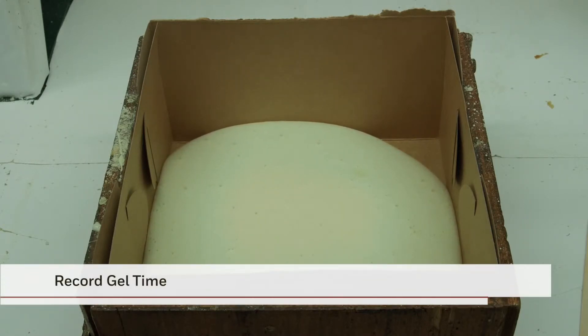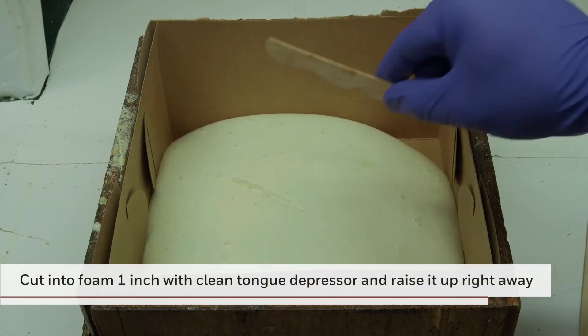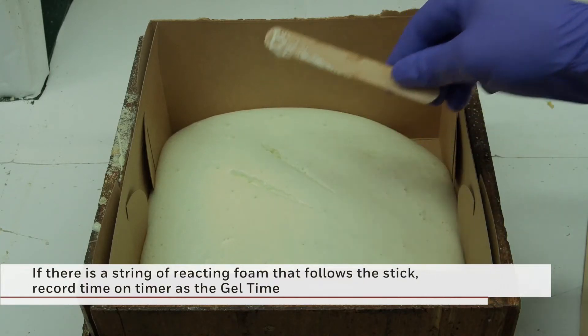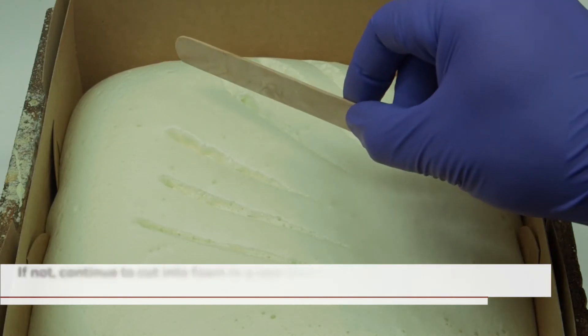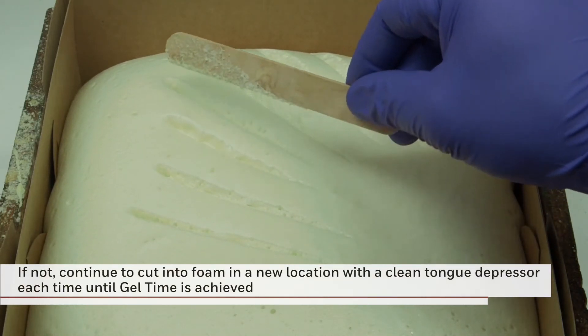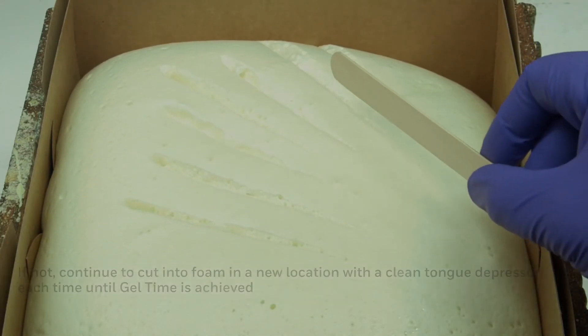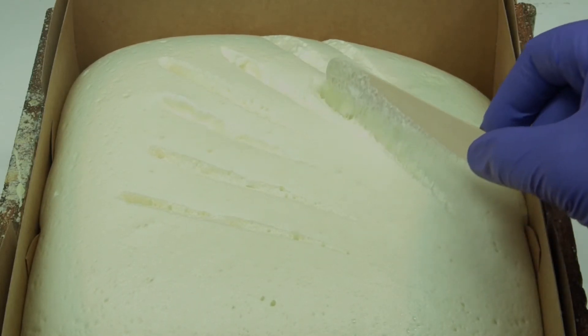Next, you can determine the gel time. Cut into the foam 1 inch with a clean tongue depressor and raise it right away. If there is a string of reacting foam that follows the stick, record the time on the timer as the gel time. If not, cut into the foam in a new location using a new, clean tongue depressor for each cut until this is observed. The formation of strings of reacting foam indicates the gel time of the foam mixture.